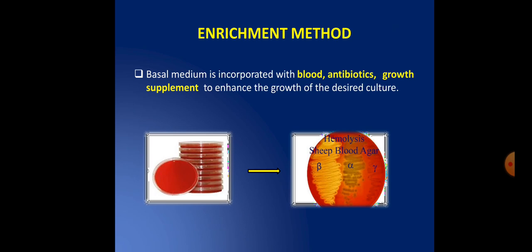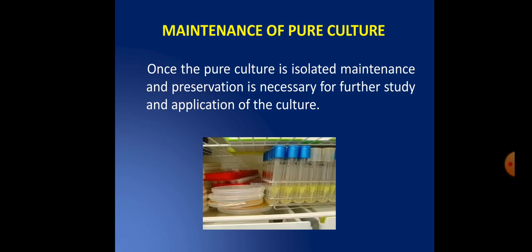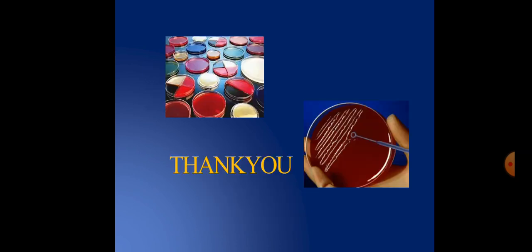Enrichment method. Basal medium is incorporated with blood, antibiotics and growth supplements to enhance the growth of the desired culture. Maintenance of pure culture. Once the pure culture is isolated, maintenance and preservation is necessary for further study and application of the culture.